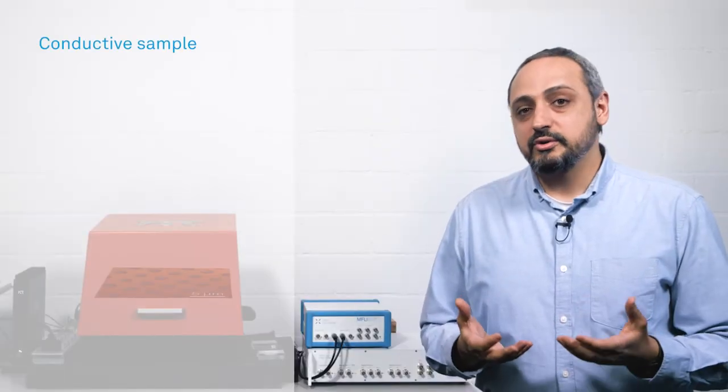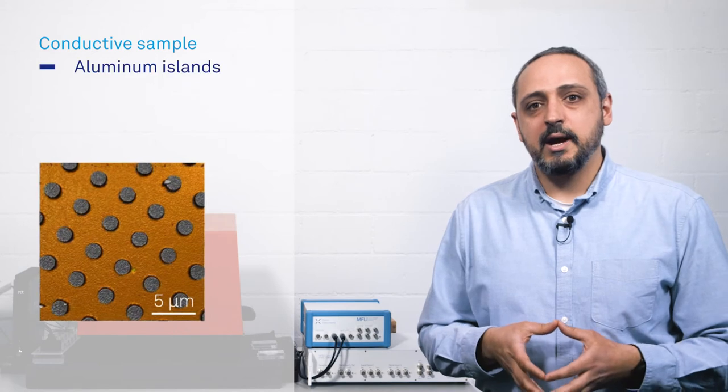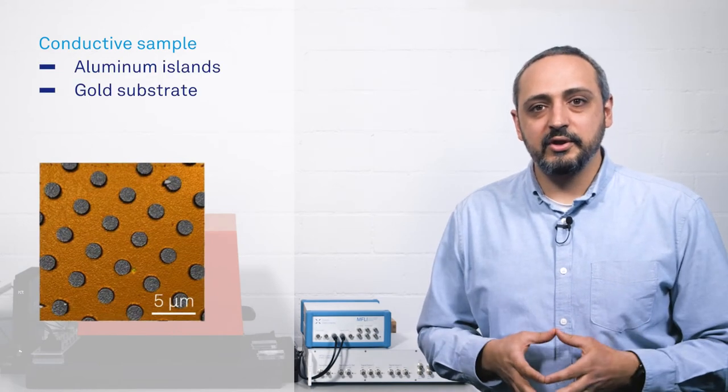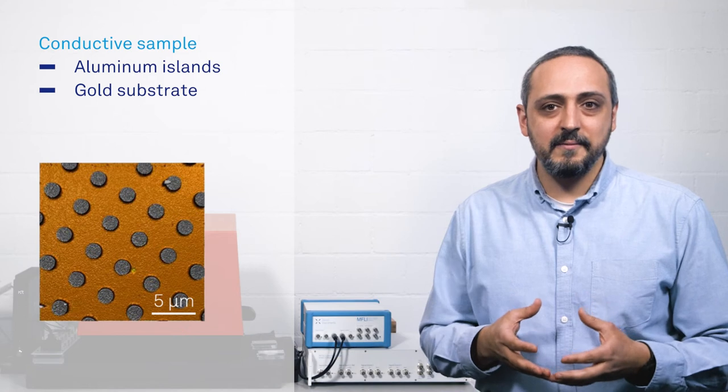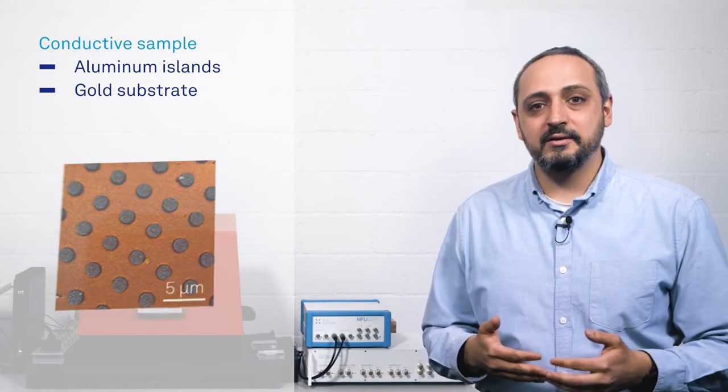We already approached the conductive tip to a sample with aluminum islands on a gold substrate, so we are ready to configure the Lock-in Amplifier for the KPFM with the included control software LabOne.